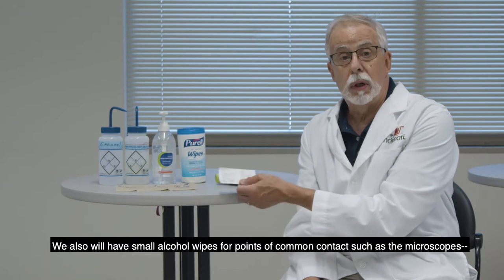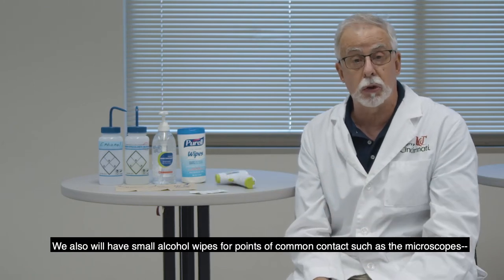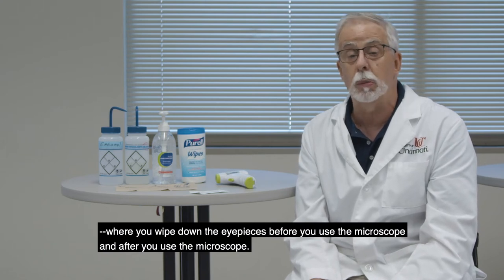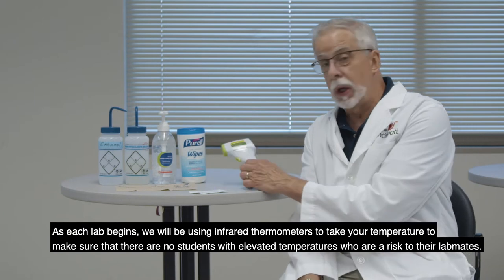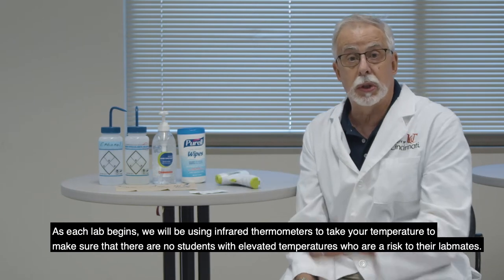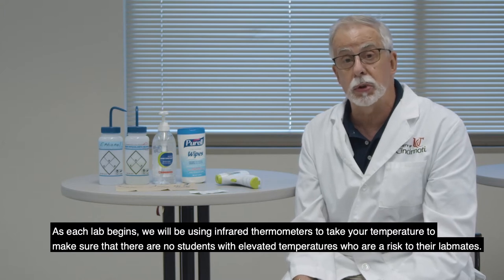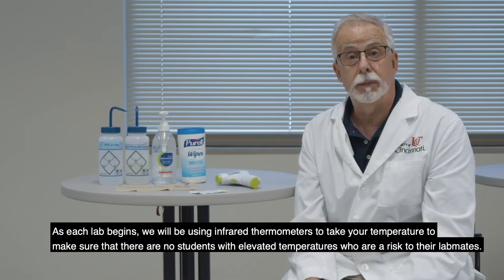We also will have small alcohol wipes for points of common contact such as the microscopes where you wipe down the eyepieces before you use the microscope and after the microscope. And as each lab begins, we will be using infrared thermometers to take your temperature to make sure that there are no students with elevated temperatures that have risk for their lab use. Thank you very much.